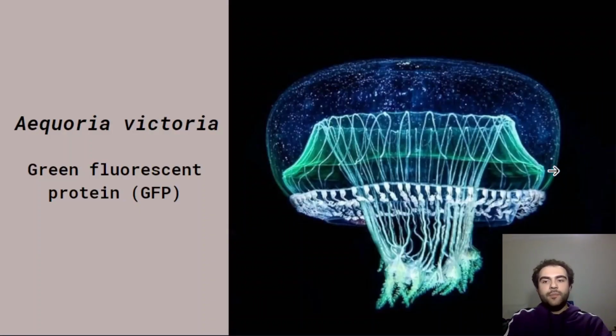And also, green fluorescent protein is another example of fluorescent protein that is widely used in FACS studies. It's abbreviated as GFP, and GFP is made by the jellyfish Aequorea victoria and is spontaneously fluorescent. The gene coding for GFP has been cloned and is now widely used as a reporter gene because the extent of its expression is readily measured by FACS.